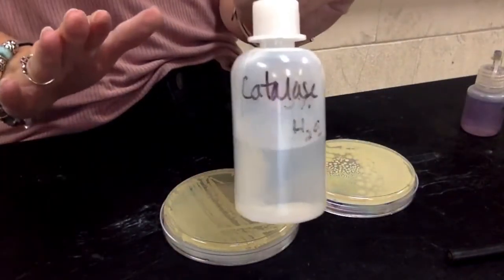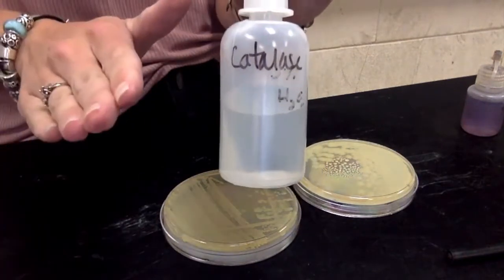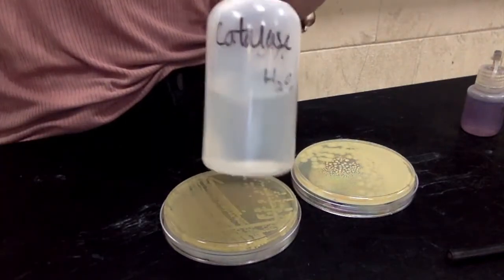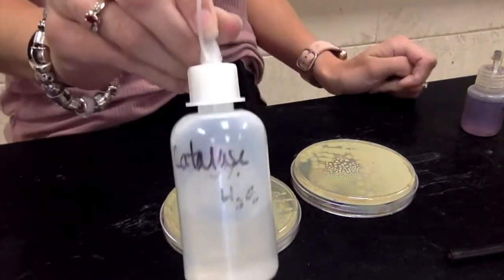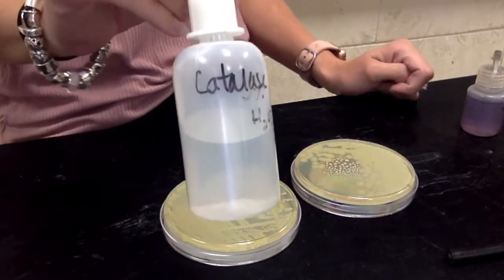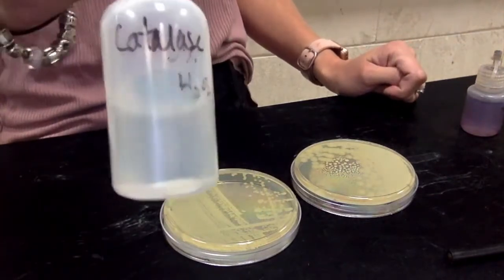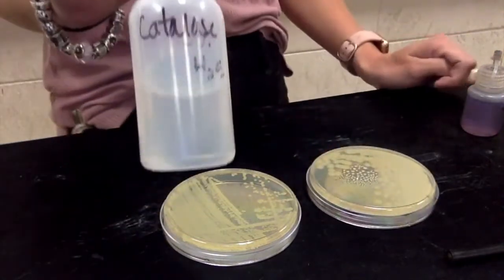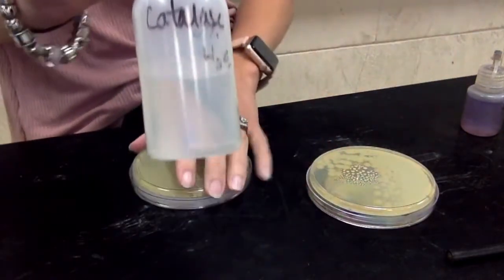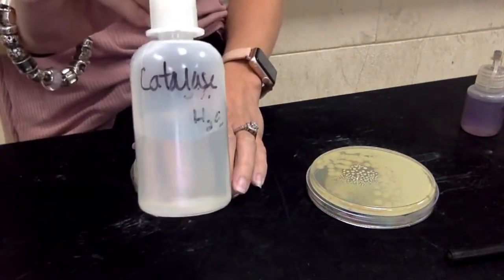And remember, what's the catalase doing? It is taking hydrogen peroxide and neutralizing it into water and oxygen. So all that is in this is hydrogen peroxide. It's the same hydrogen peroxide that you use at home on your bobos. So what's going to happen is if the bacteria produces catalase, when I put this hydrogen peroxide on these cells, they're going to freak out.